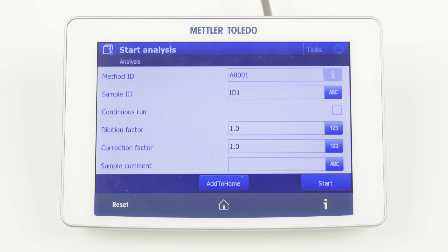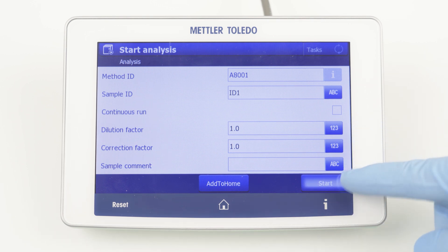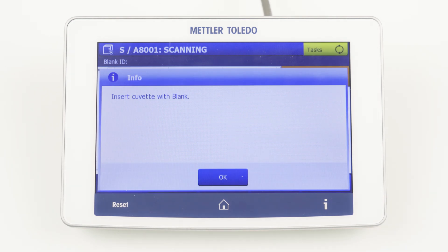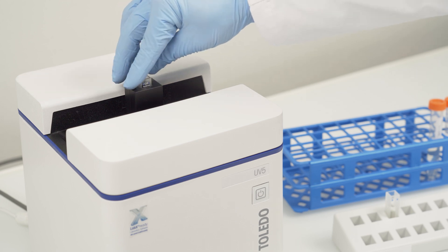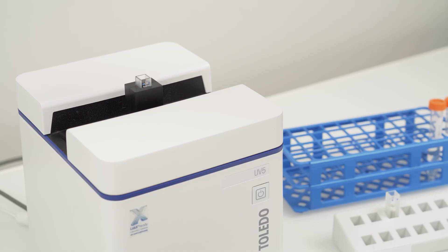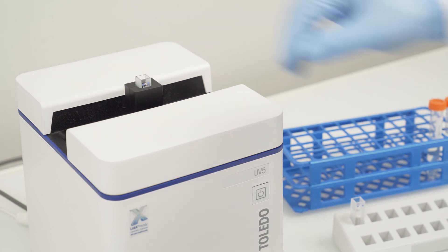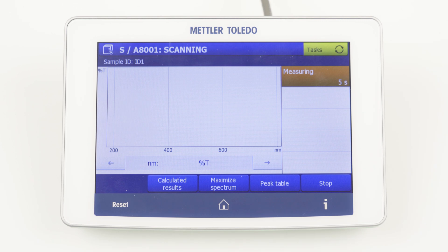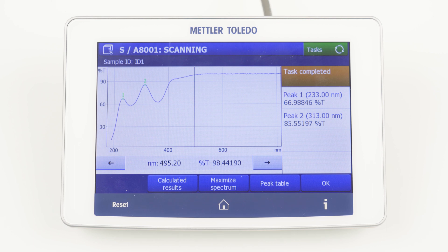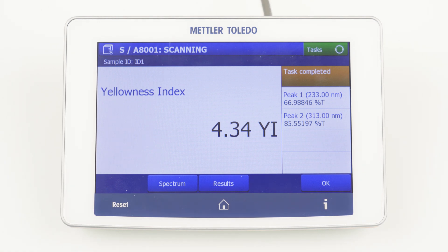Now you can define the sample ID and change the dilution and correction factor if needed. Clicking Start a second time will guide you through the workflow. First, you have to insert the blank cuvette. By clicking OK, the blank determination starts. Afterwards, we are asked to insert the sample cuvette. Again, the measurement is started by clicking OK. The measured transmission spectrum is shown on the screen.